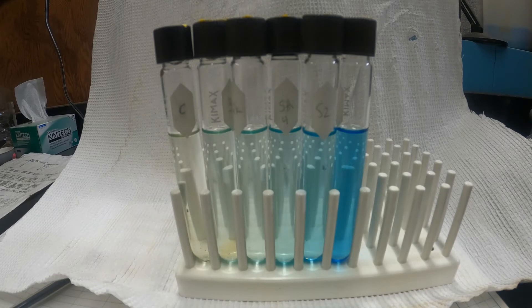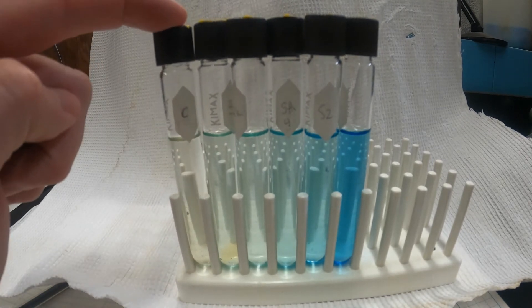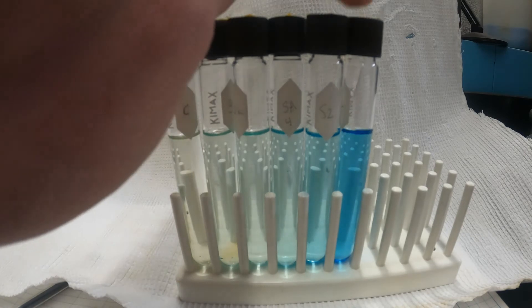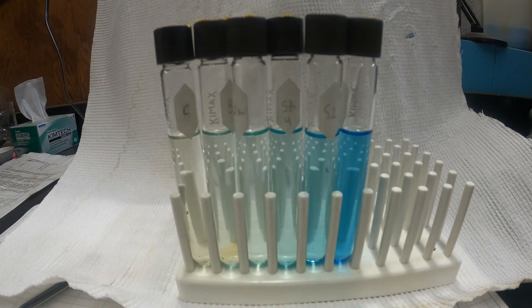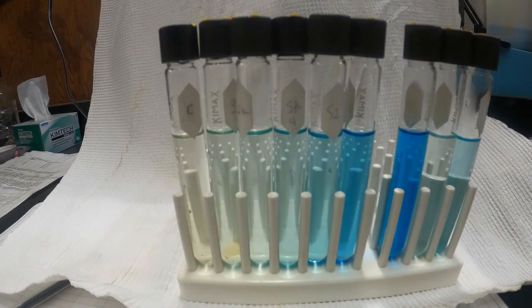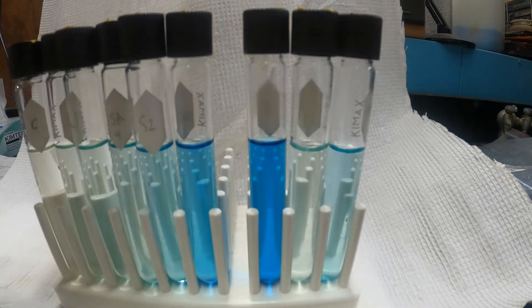The tubes have been incubating for about three hours. You can see these are our standard curve tubes — the one on the far left is a blank, and they're increasing in concentration all the way up to the high standard on the right. Here's an example of each of the three test tubes from Willow Lake. You can see there was some variation in ammonium concentration with depth.